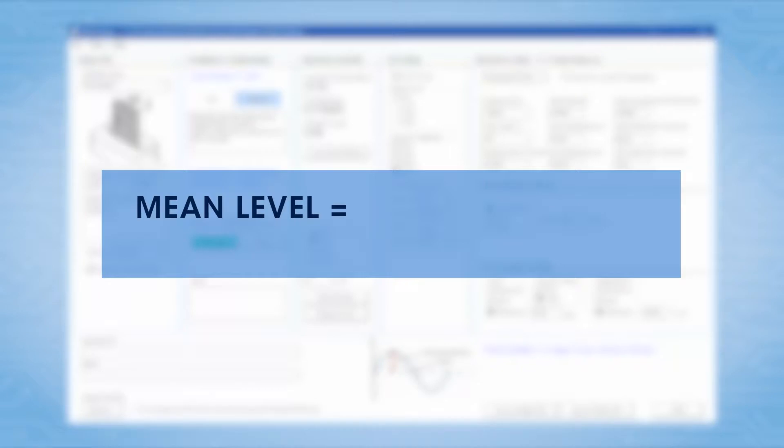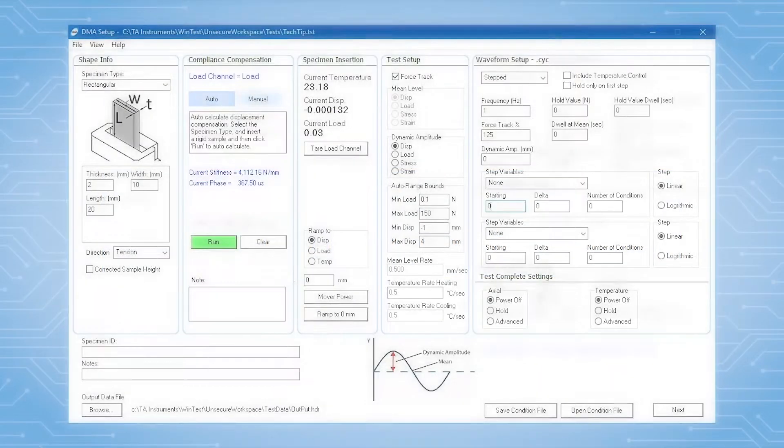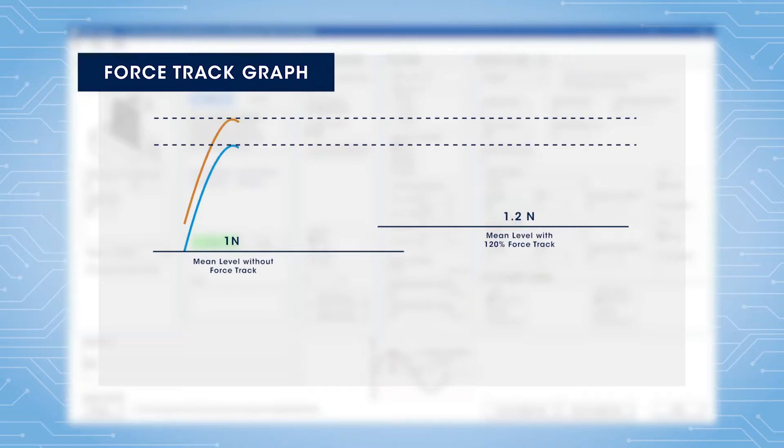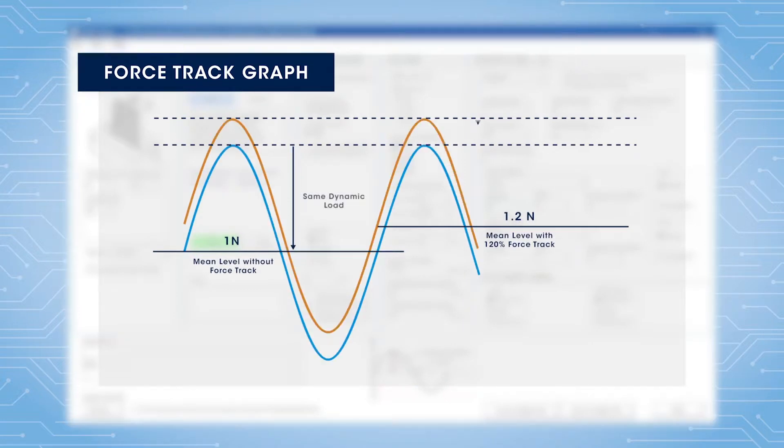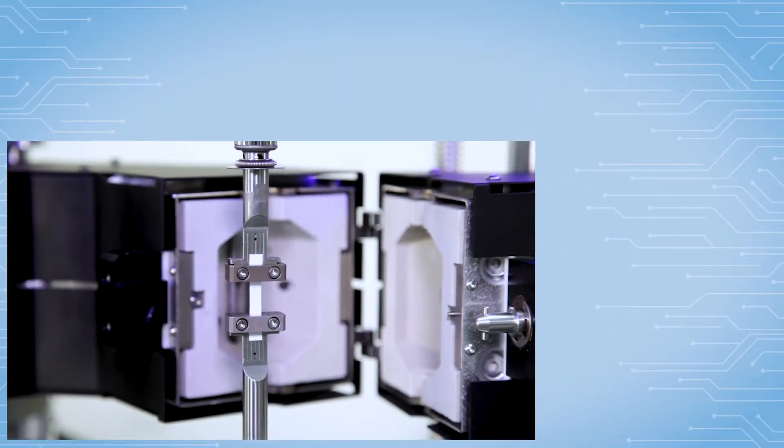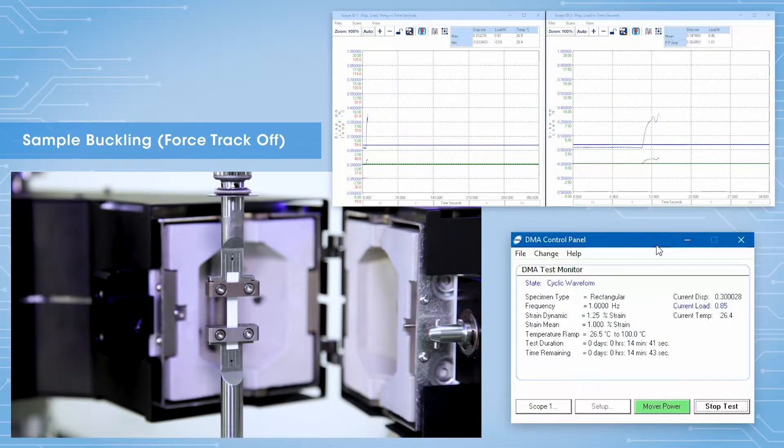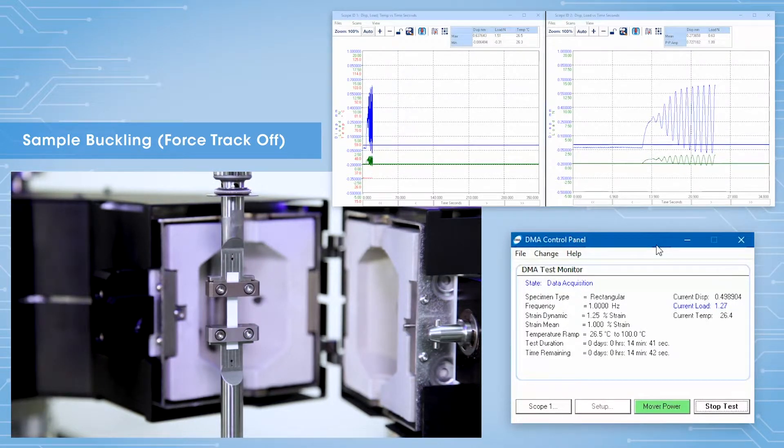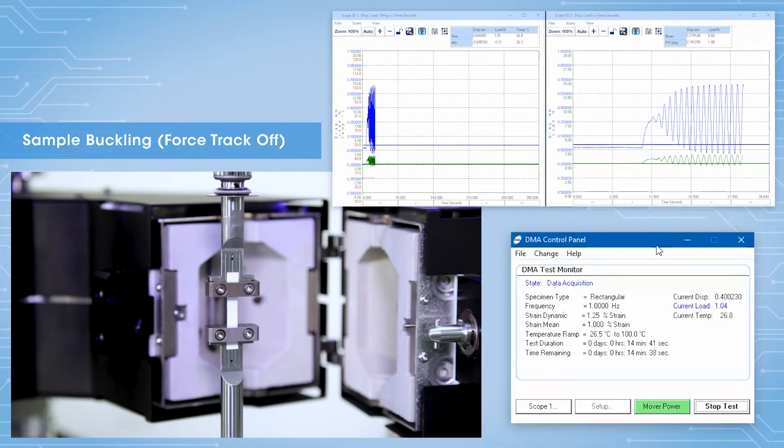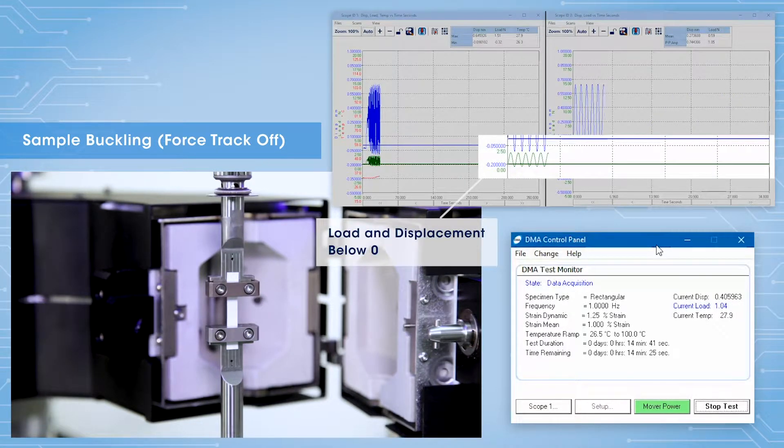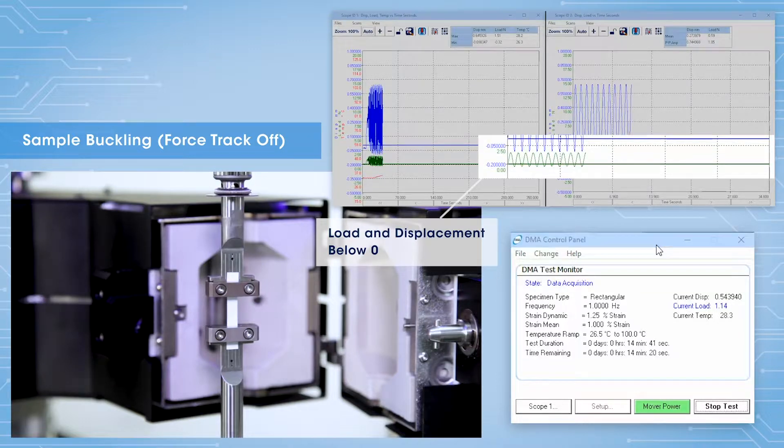The new mean level is equal to the entered force track times the required load amplitude for the test as measured by the system. This mean level is recalculated continuously throughout the test. So, let's say the force track was set to 100% at the mean amplitude of 1 newton with an oscillation force of 1 newton. This would be the absolute minimum static force so that your force would vary from 0 to 2 newtons.